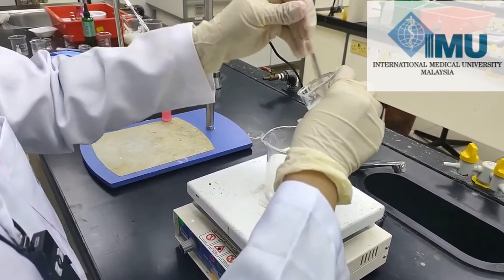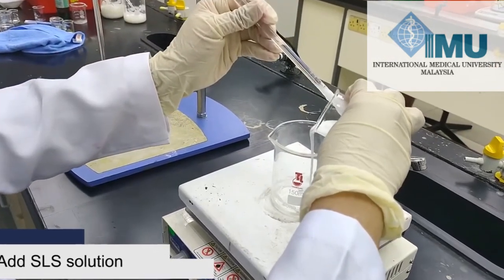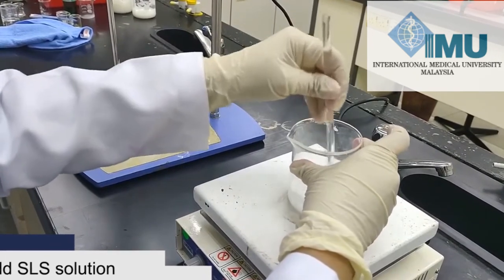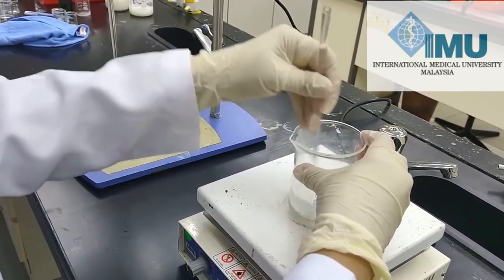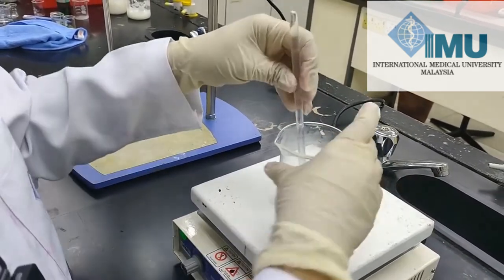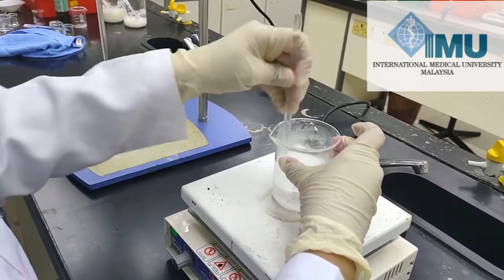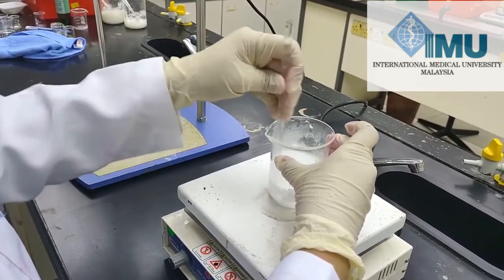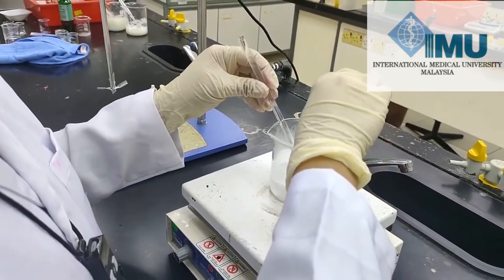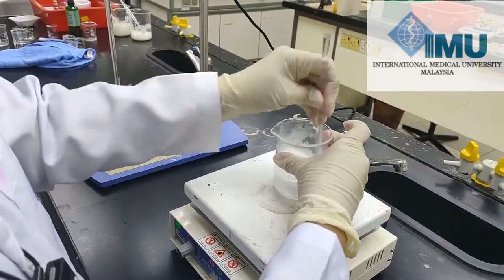We will add a small quantity of the sodium lauryl sulfate solution into the melted oily phase and mix it. Because the sodium lauryl sulfate solution is at a cool temperature, it may cause some congealing, so you have to add it in small portions and mix the oily content gradually.